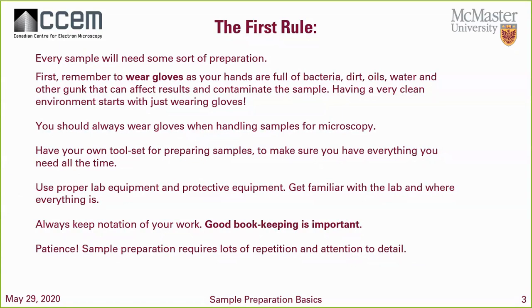Your hands are full of bacteria, full of dirt and oils, water especially. Remember, we're going to put our samples in very harsh environments, so we want to make sure that they're dry, right? And free of other gunk. This will for sure contaminate your surface. It will affect results. So just having a very clean environment is a good way to start. And it starts with your hands, right? Especially with everything that's going on around us these days. I think that goes without saying.